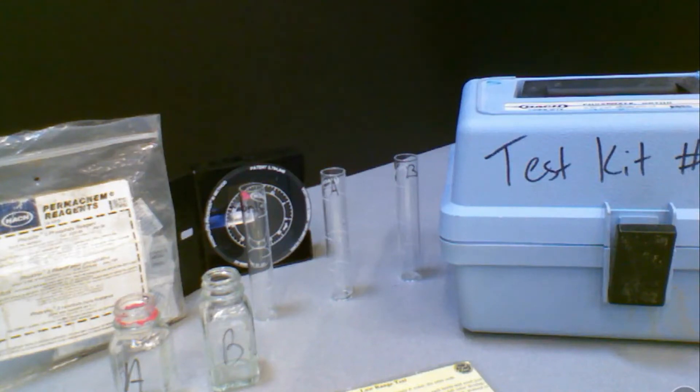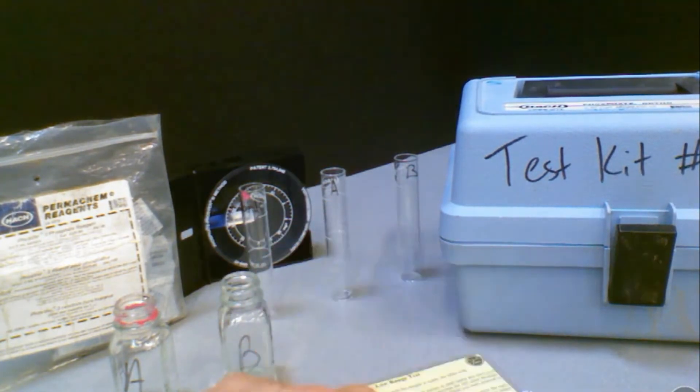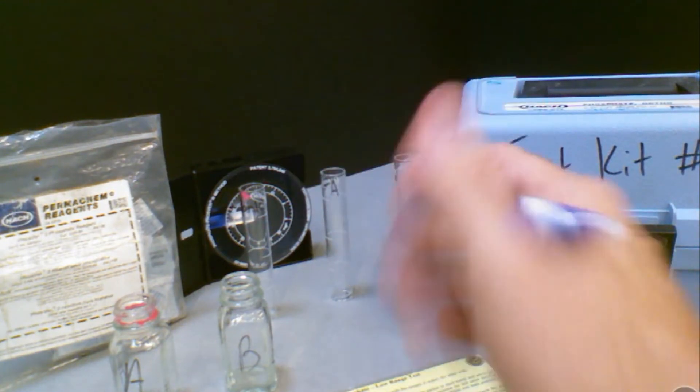This video will cover how we test for phosphate in the stream. When you open your kit up, the first thing you'll notice is that there's a variety of different materials. You are using glass bottles here, so please be careful on how you handle those at the test site. The first thing to point out is you will have some square mixing bottles, labeled A and B for both your samples. You also have some regular test tubes in the back.